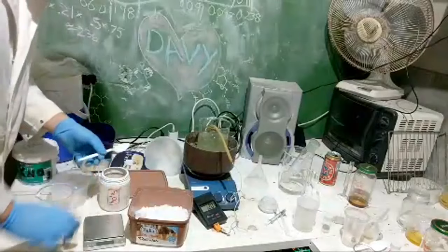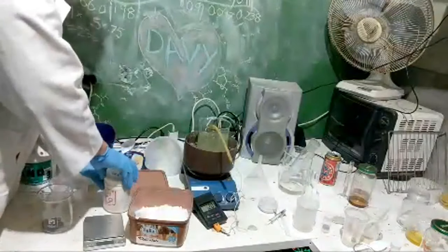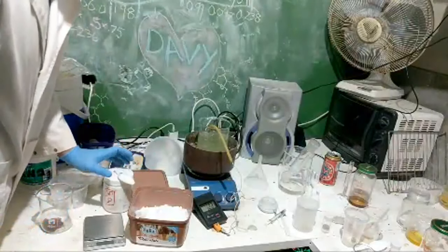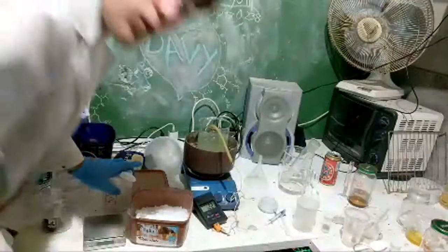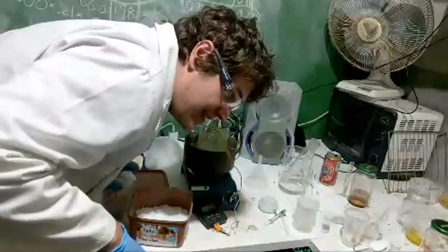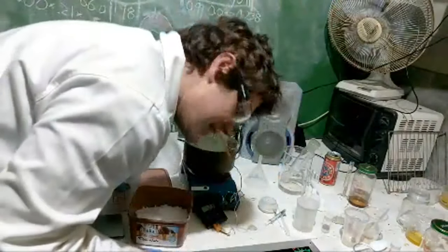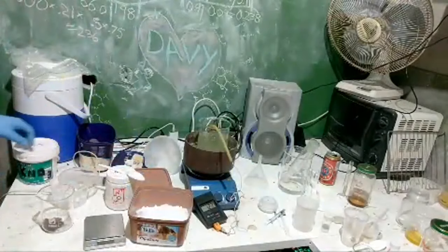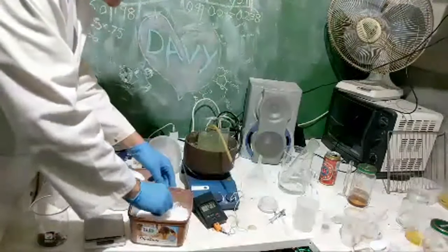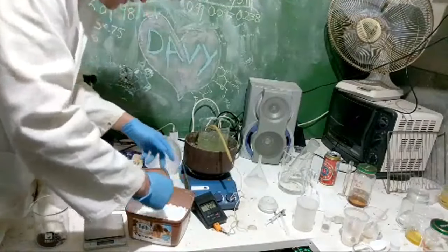So that's probably enough iron oxide. Use more, yeah. Well, how much does the stoichiometric gods say you should use? I believe in this scenario, you guys are the stoichiometric gods, right? You can't expect me to know everything. I'm relying on chat to tell me how to bloody mix these chemicals, which is just an awful decision, honestly. All right, 12. It's spiking a bit, but we might just keep going.